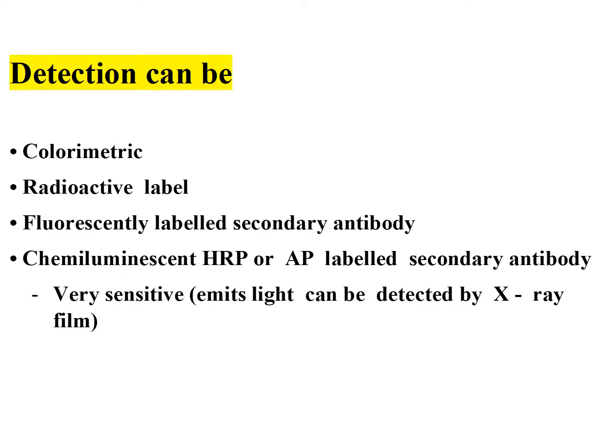You're saying, why would you do that? Sensitive, very sensitive actually, and you don't have to play with radiation. Okay, so the colorimetric's the cheapest, but not as sensitive. So you have a protein that's very low expressed, you probably need to do something very sensitive. So there's a sensitivity issue here as well.